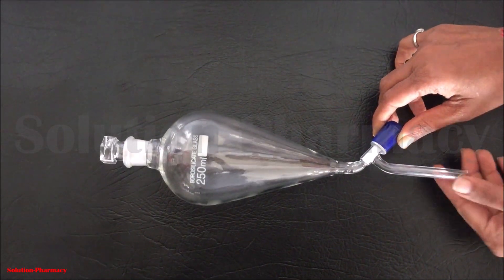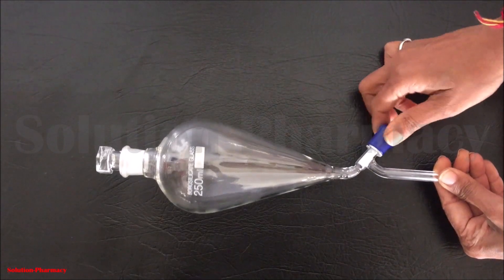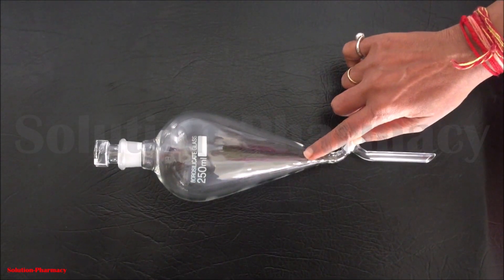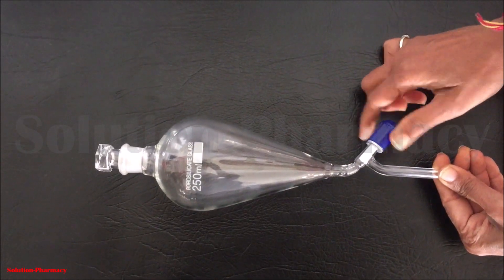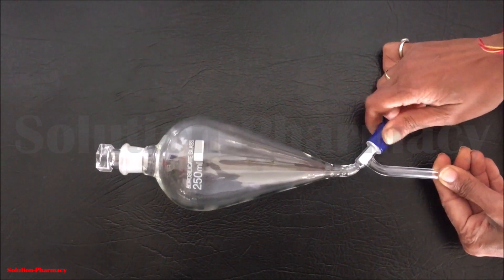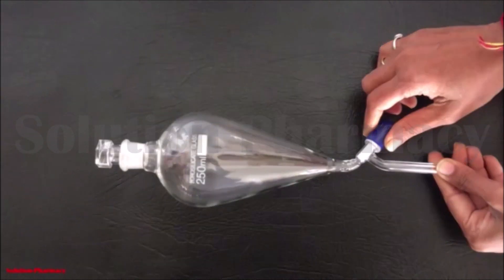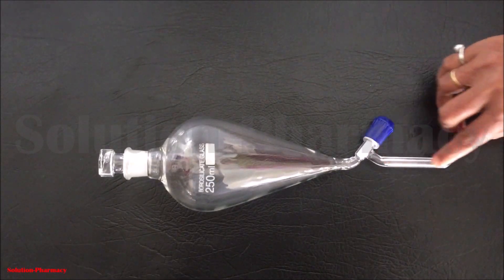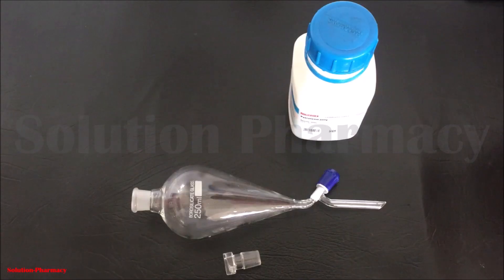This is the stopcock of the separating funnel. We open this stopcock when we want to drain out and collect the liquid. During shaking or extraction we tightly close this stopcock. Always before starting the experiment, check the stopcock for any leakage. This is the stem of the separating funnel, from which the liquid comes out into the collection container.